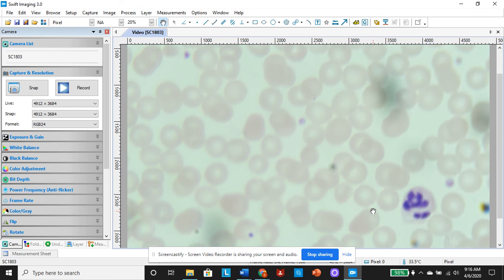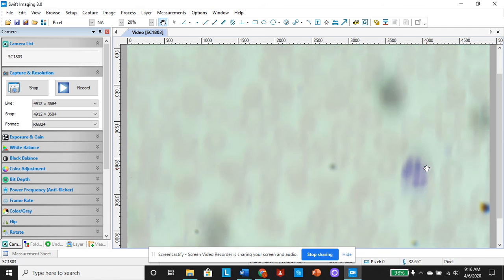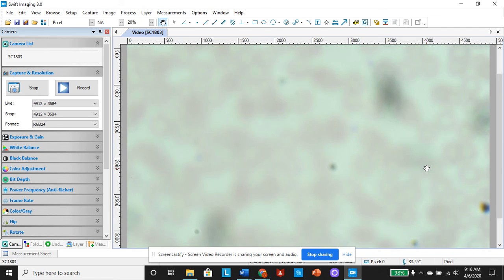They have granules inside them too, just like the neutrophils do, but they're much bigger and coarser. If I can find one, I will totally show it to you. You see all these little granules in here. Again, the antihistamines and the antibacterial, antiviral. They just have all sorts of good chemicals in them that can help kill things that are not supposed to be in your blood.